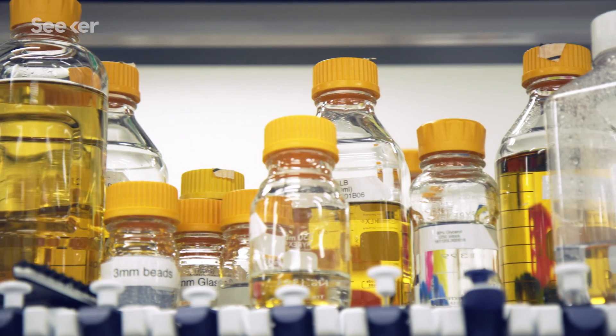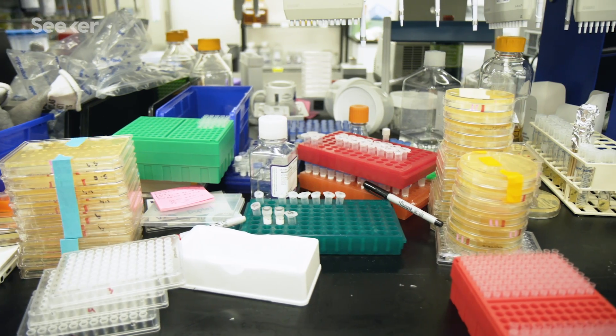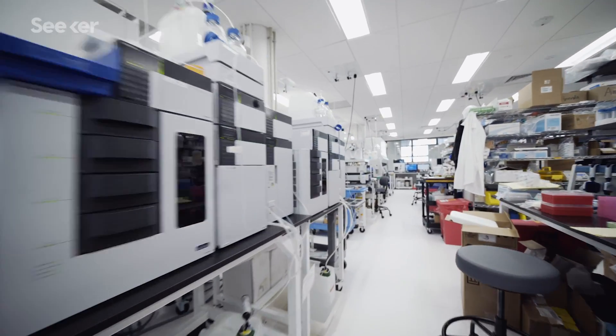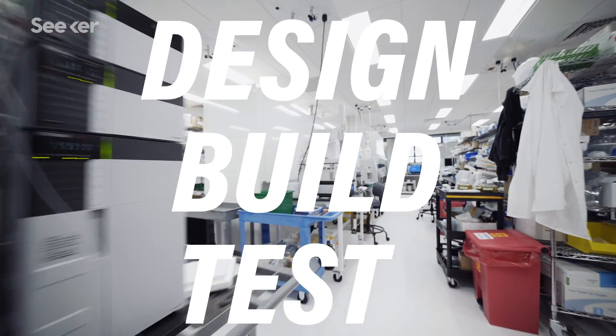Once you pick an organism you want to run with, how exactly do you engineer it to do what you want? At Ginkgo, it's a classic engineering cycle: design, build, test.